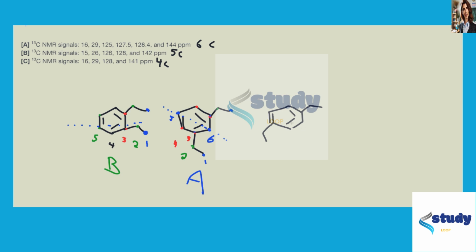So now, if you look at this isomer, and if I were to draw this one better, and if I were actually to rotate it like this, then we see that we actually have 2 internal planes of symmetry. One that goes down the middle like this, and then one that goes through those 2 ethyl bonds like this. So you have 2 internal planes of symmetry. So what does that mean? Well, that means that what's true on one side will be true in all other quadrants.